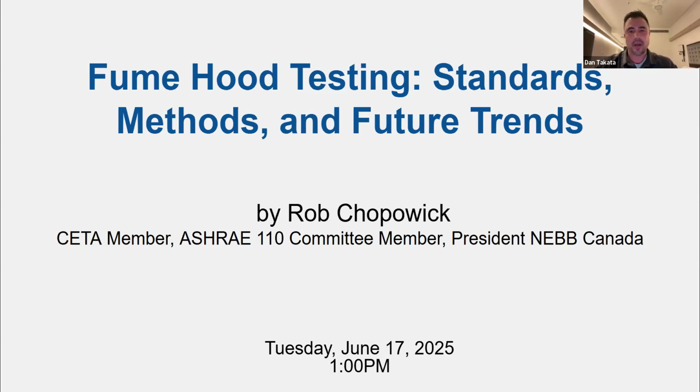Today's webinar, entitled Beyond Containment, Current Issues in Fume Hood Testing, will be presented by Rob Chopowick, who's an experienced professional with deep knowledge in this area. Rob will walk us through key concepts, challenges, and testing methodologies involved in certifying fume hoods. Whether you're new to the topic or looking to refine your existing knowledge, there should be something here for everyone.